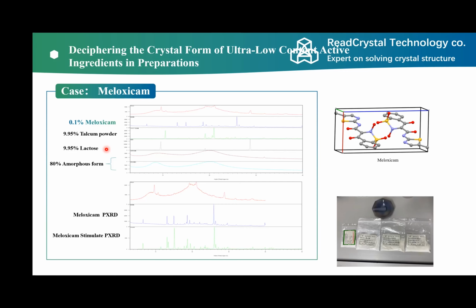So normally, powder X-ray diffraction is used to determine the polymorph of a minor phase in a mixed sample, for example, in a pellet. But there is a limitation for powder X-ray diffraction. You can only determine the content if it is higher than a few percent, for example, 3% or sometimes 1% if your instrument is good enough.